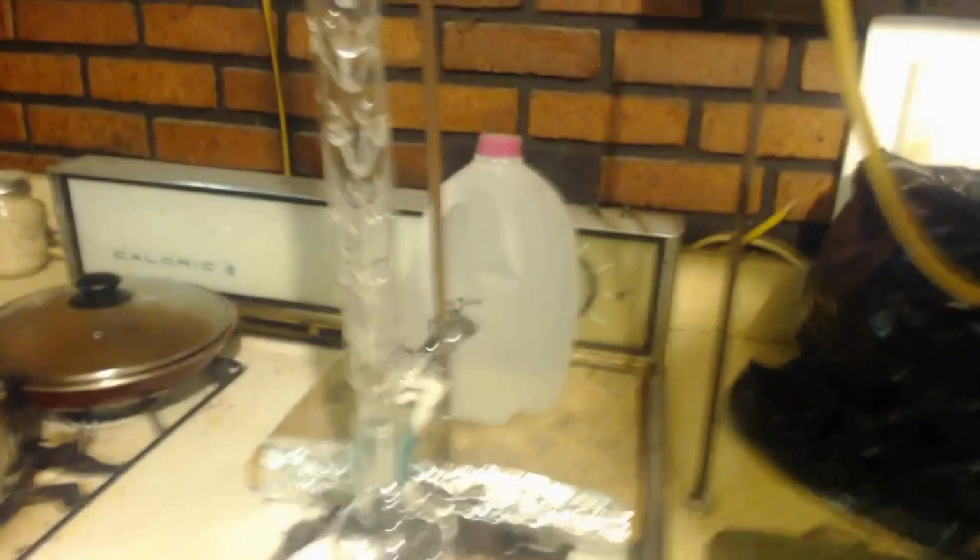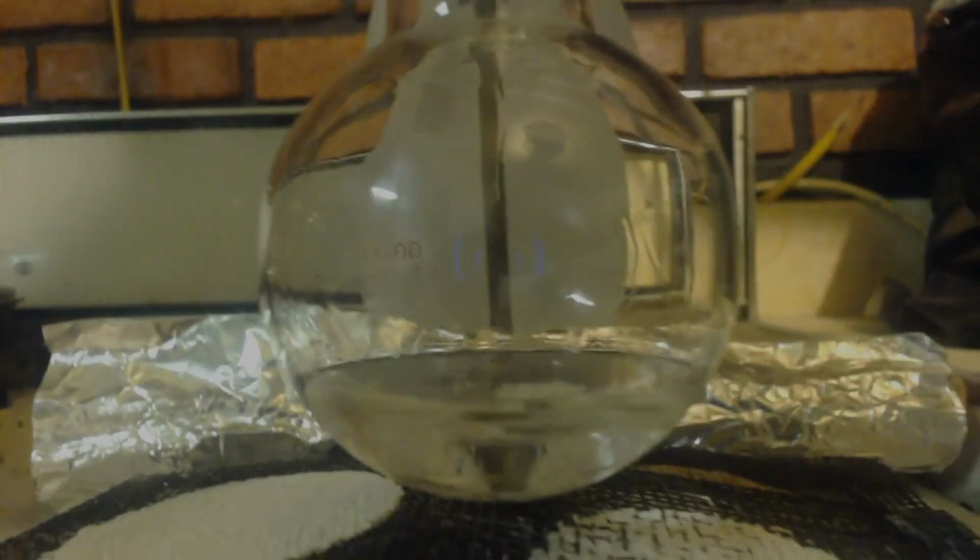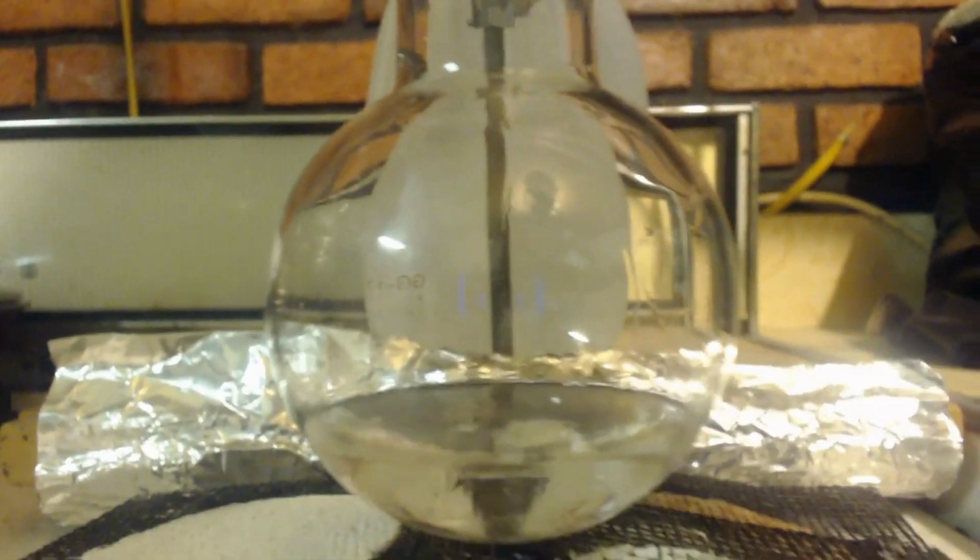Anyways, I'm going to distill it. So I don't expect to have a good yield. I don't expect any yield at all, really. You can see it's starting to boil.